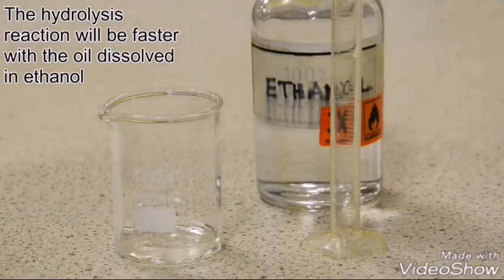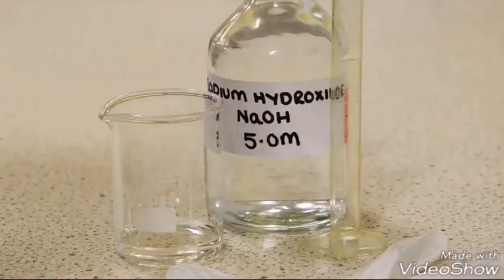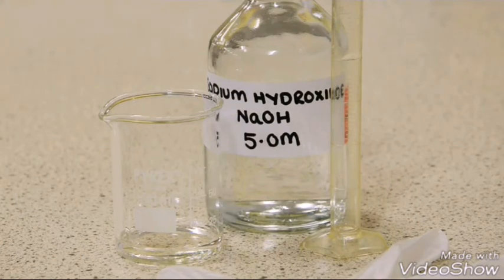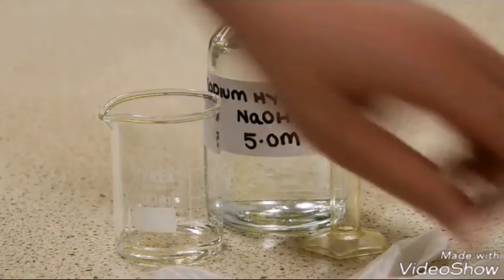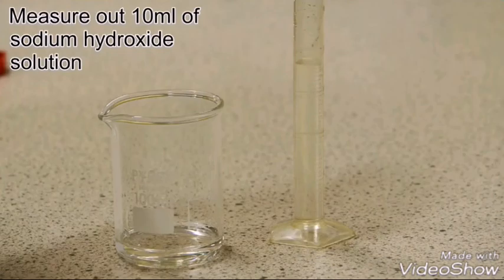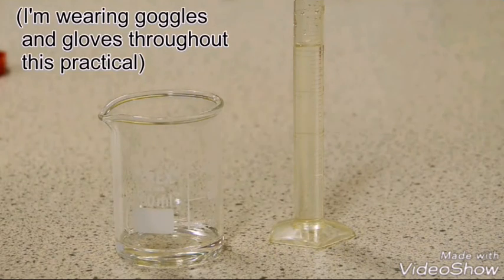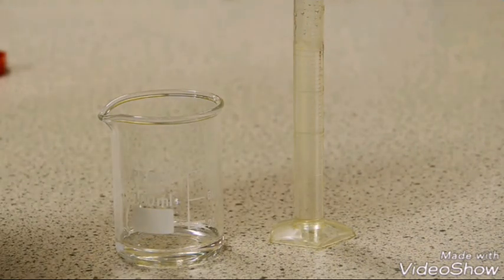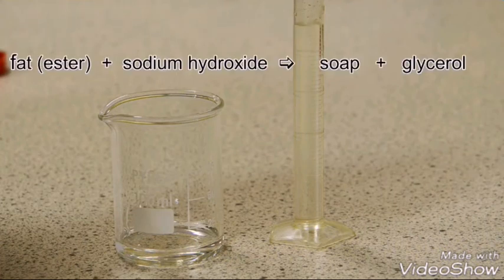Now I'm going to very carefully measure out 10 milliliters of sodium hydroxide solution. This is highly concentrated. It's 5 moles per decimeter cubed, 5 molar solution. We're using sodium hydroxide because soaps are the sodium salts formed when long-chain fatty acids found in fats and oils react with sodium hydroxide according to this word equation.